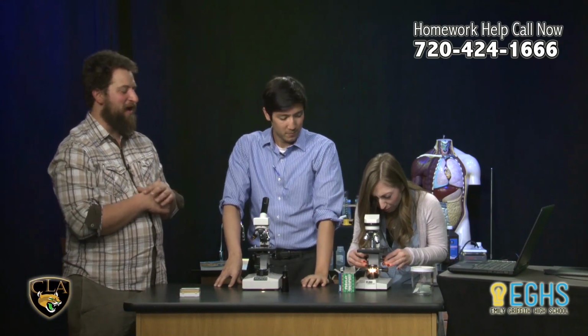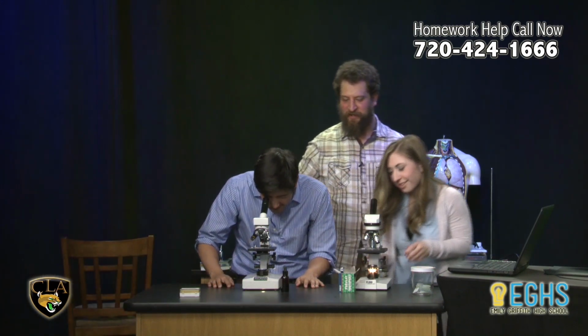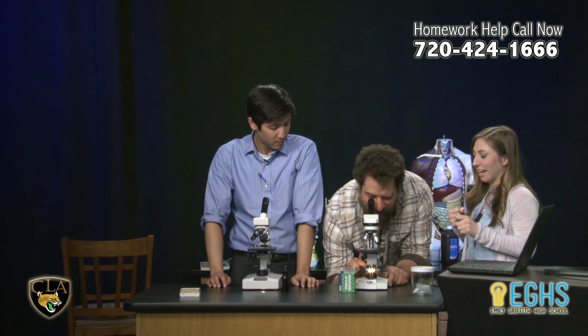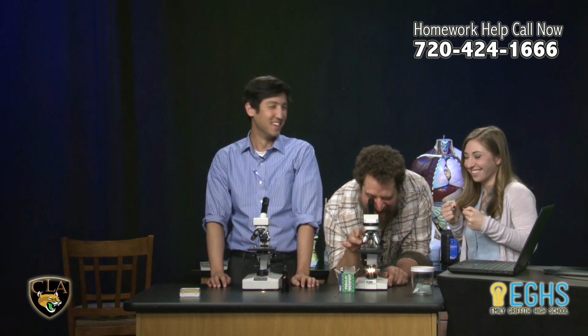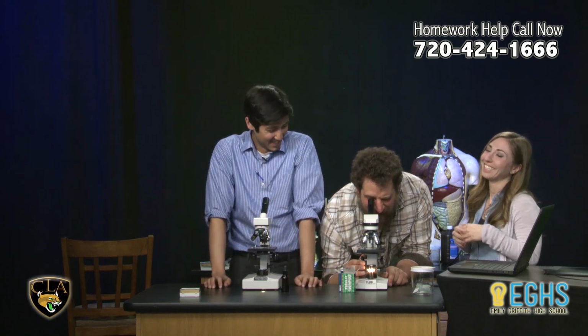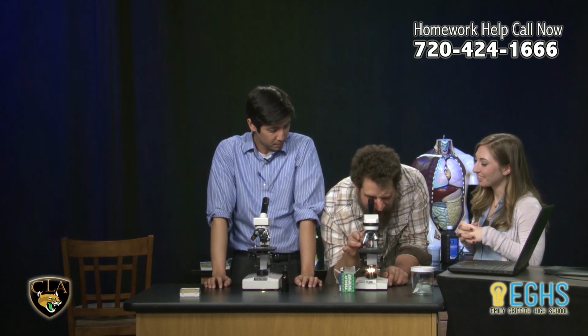So, Becca, have you gotten your little blue dots? I think so. Can I check just to see? Yeah, let me just double check. Okay. All right. Oh look, did you already zoom in? Yeah, I zoomed in. Okay, Becca, overachiever. She's like that student who's kind of ruining your lesson because she already figured everything out. Becca, you did not get many cheek cells, but that is definitely one right there. Okay, so can we try to get that one? Okay, fine, Becca, you win.